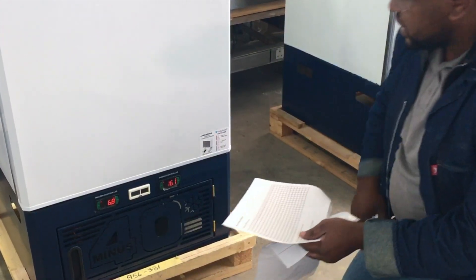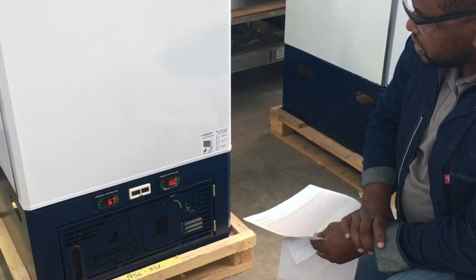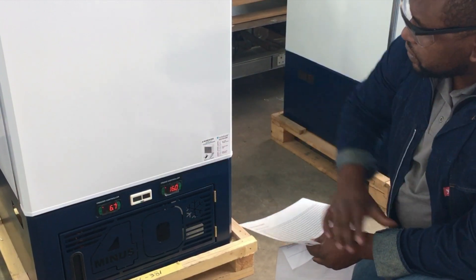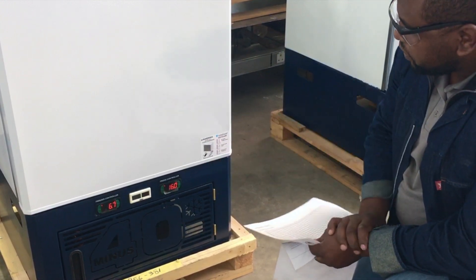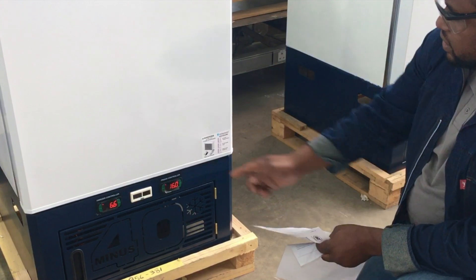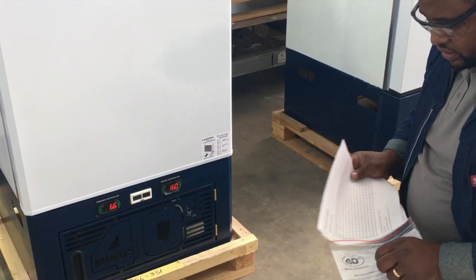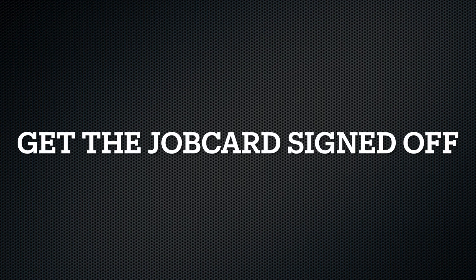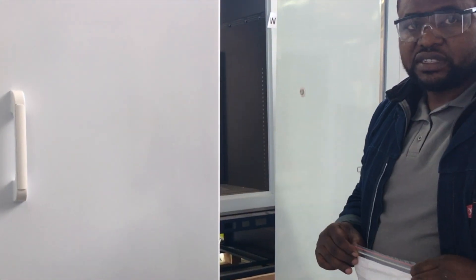After all that, sit for a while and make sure both temperatures are going down. The freezer controller display temperature goes down quickly compared to the fridge one, but after 5 to 6 hours the fridge will also reach its set point. Make sure that the ICT job card is signed with the stamp from the nurse or the person in charge.